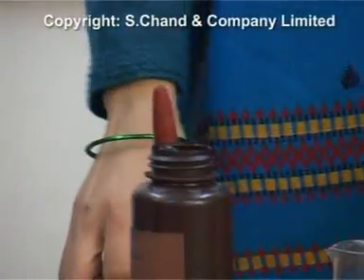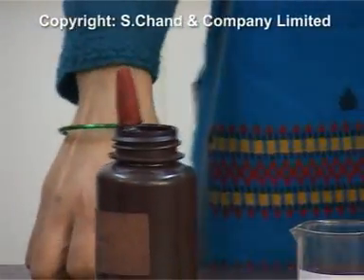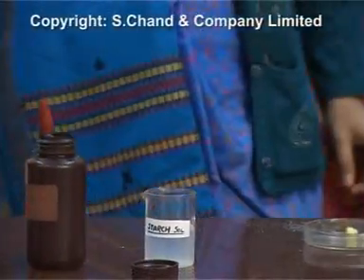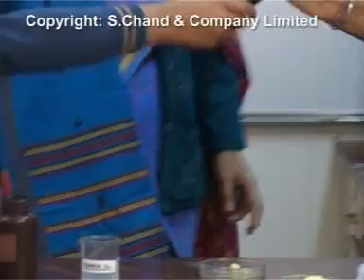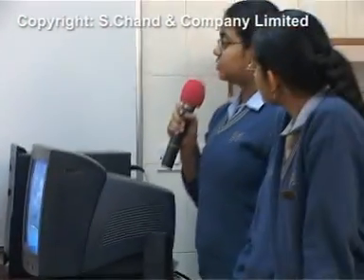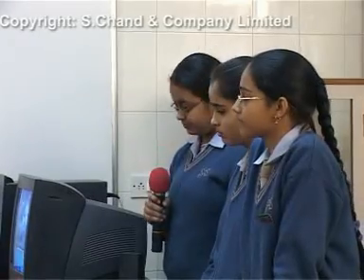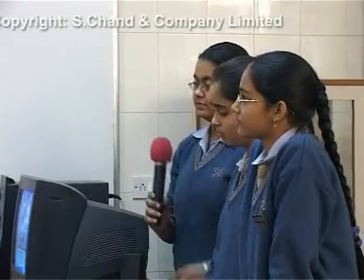Now let's start the experiment. Ma'am, which other solutions can be used to detect the presence of starch? We usually take iodine solution only for testing the presence of starch.